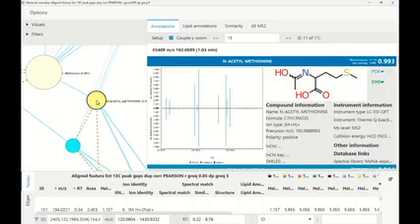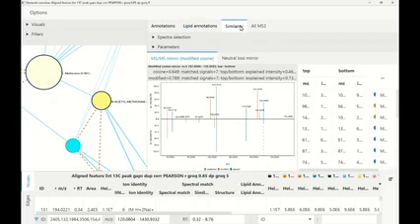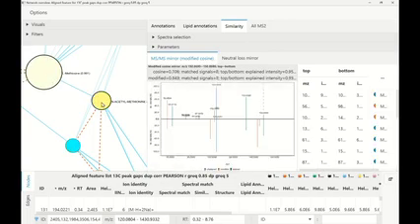And now you would wonder, why is there a connection between these two? Okay, structurally, they're already similar, right? But show me why they are similar. We can hold shift and then click on both, and then look at the similarity. So on the top, there's the similarity tab, and similarity really gives you a mirror match of these two nodes. So again, I just click on one and then shift-click on the second one.